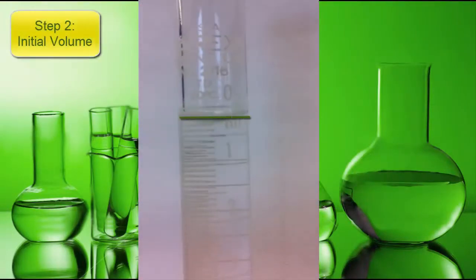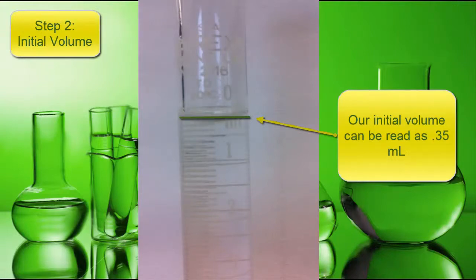Step 2: Finding the initial volume. Our initial volume can be read as 0.35 milliliters. Again, this is two decimal places.